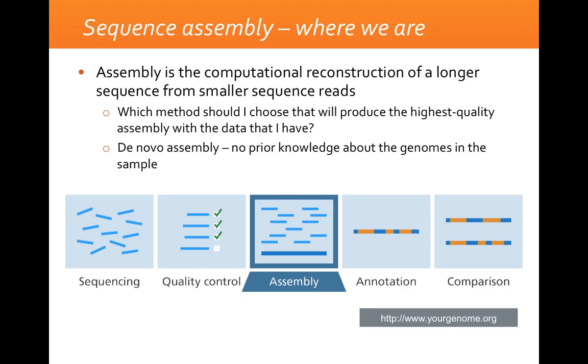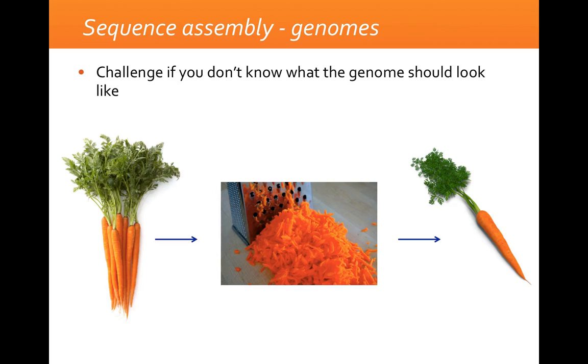But for metagenomes, you rarely have a complete reference genome, so it's de novo assembly that is the most common thing to do.